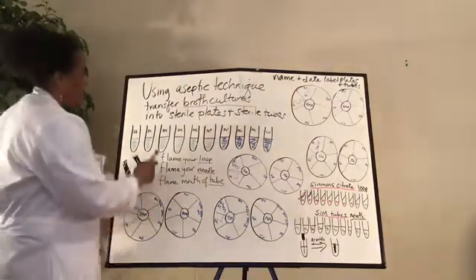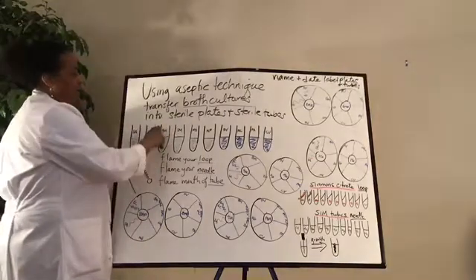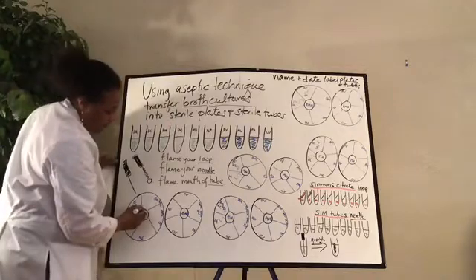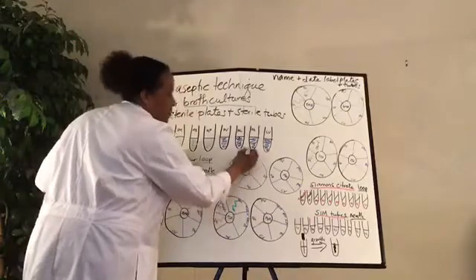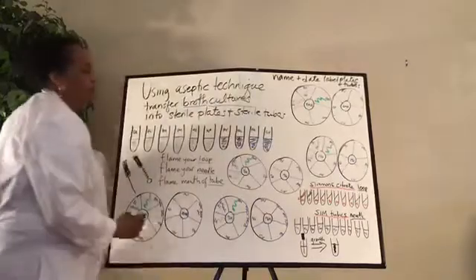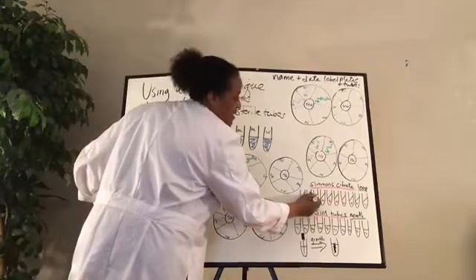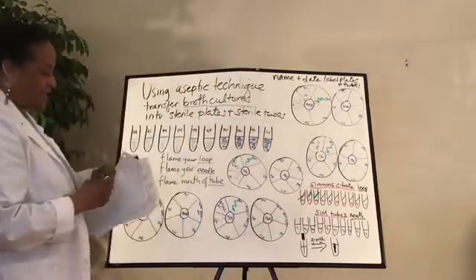Let's go into B, Bacillus megaterium. Flame the loop, flame the mouth of the tube. Go in and get your BM. Inoculate all your BMs. Now in between, of course, you're flaming the loop, flaming the mouth, etc. And you might as well just go in and inoculate this. Start here, streak up, and now that's inoculated.